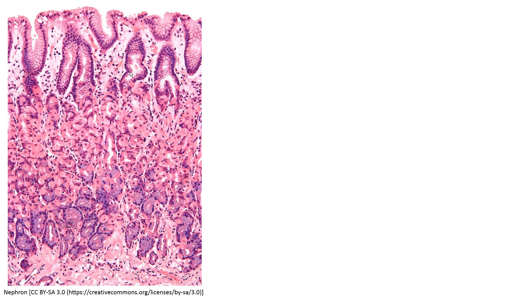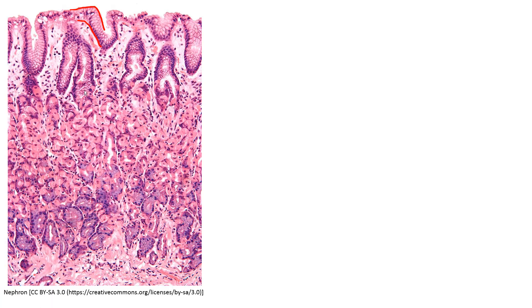In this higher-magnification image we can see the distinctive surface epithelial cells at the top, then mucus neck cells, and then very distinctly the parietal cells. Parietal cells are large, red, and tend to be fairly round and circular in shape. Further down we see the blue chief cells. If you get a good section at good magnification, it's not really hard to distinguish between parietal cells higher up in the gastric glands and chief cells lower down.